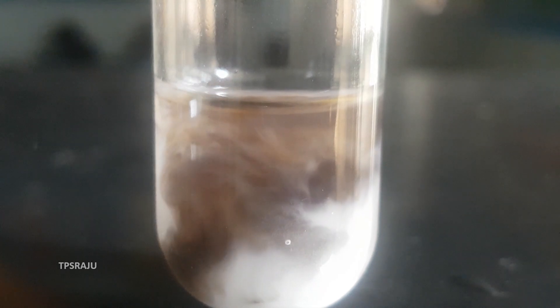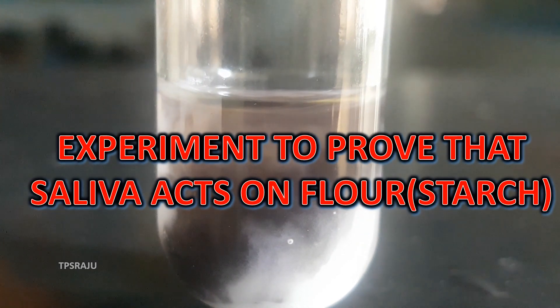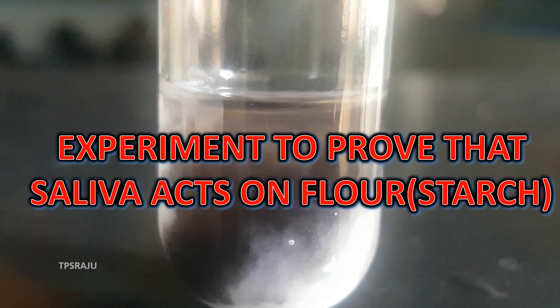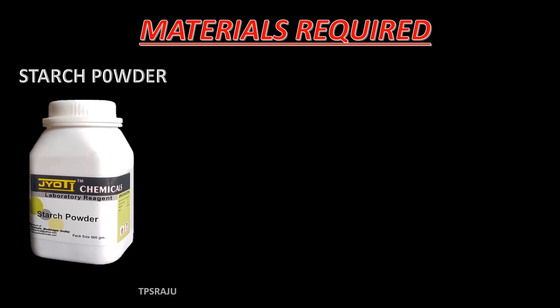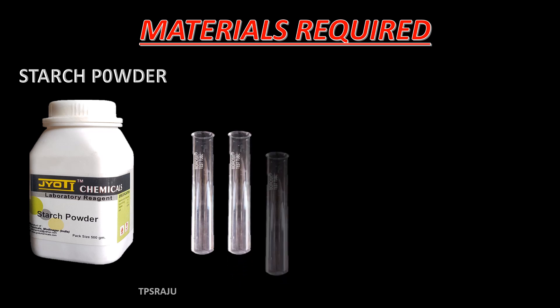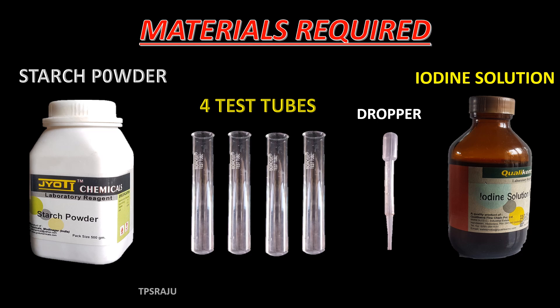Good morning. Today we are going to do an experiment to show how saliva acts on starch. For this experiment we need some materials such as starch powder, four test tubes, a dropper, and iodine solution.